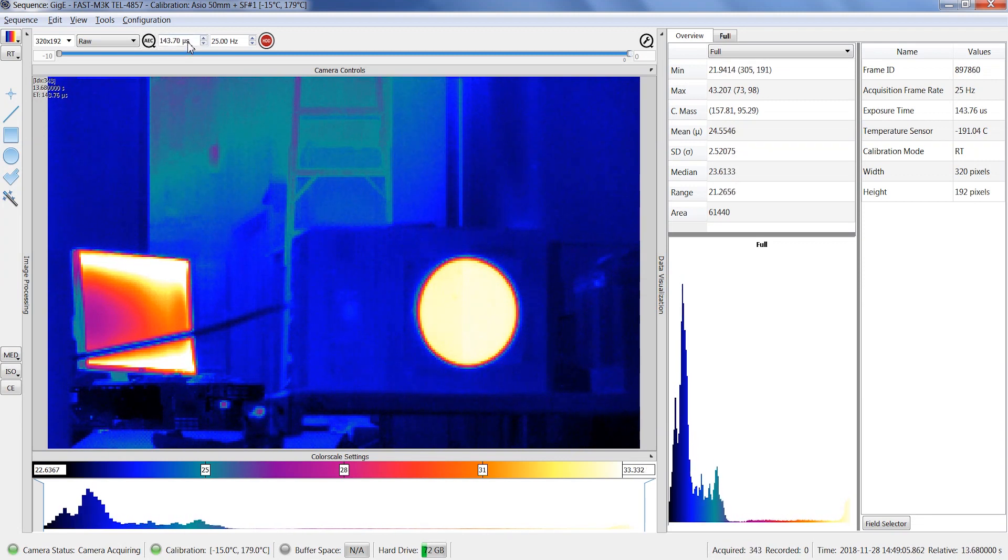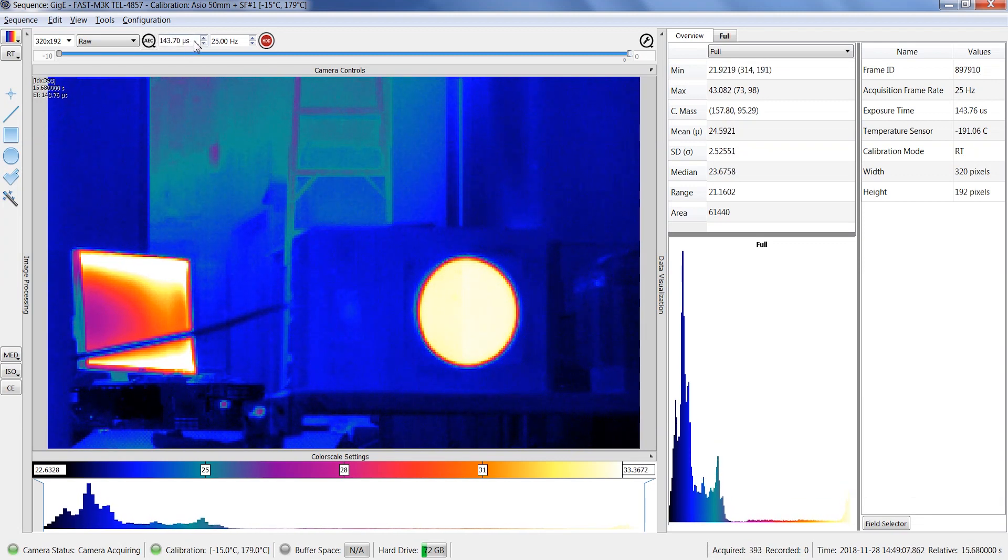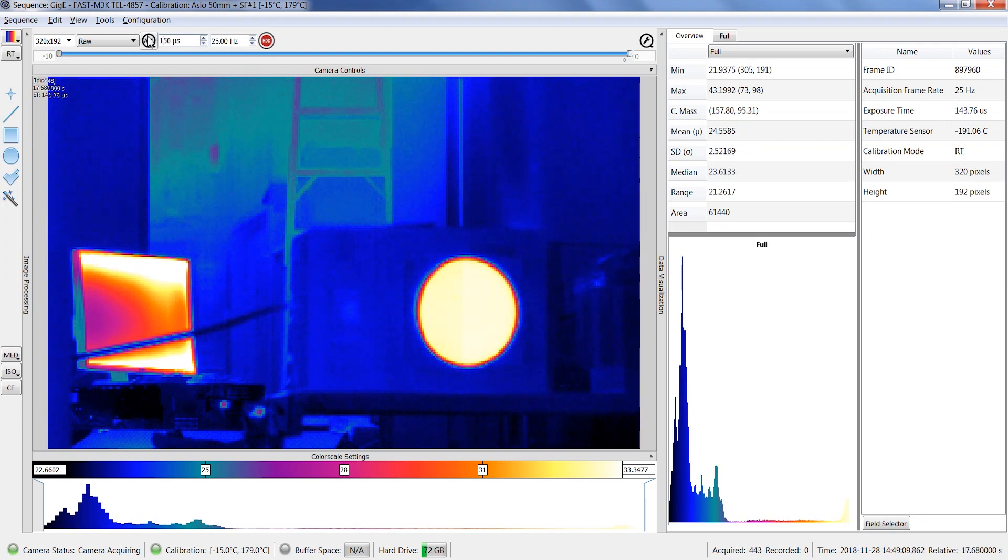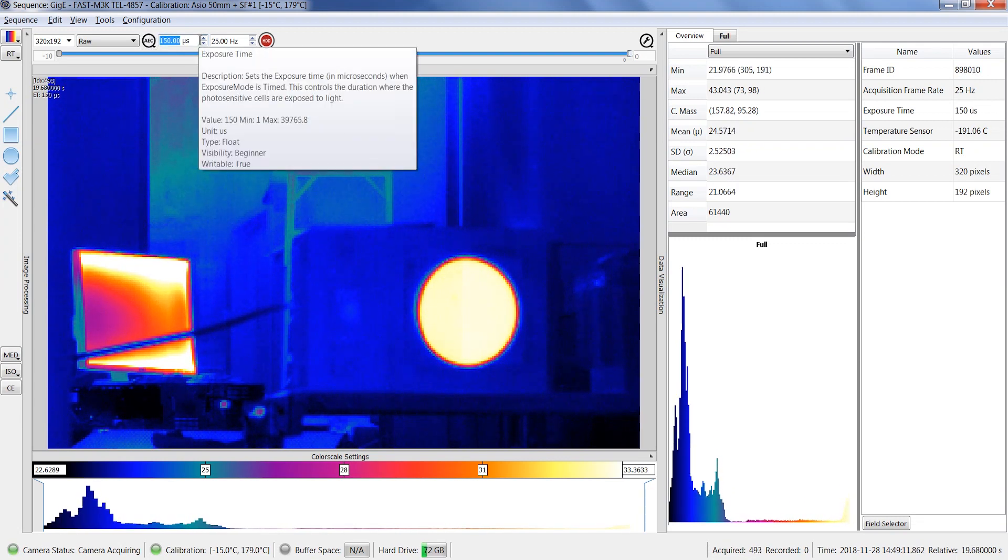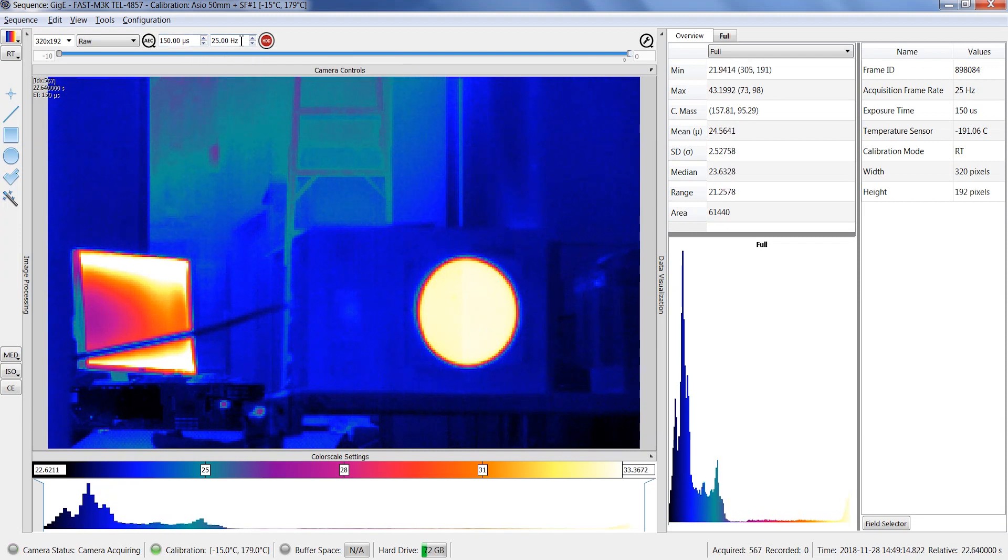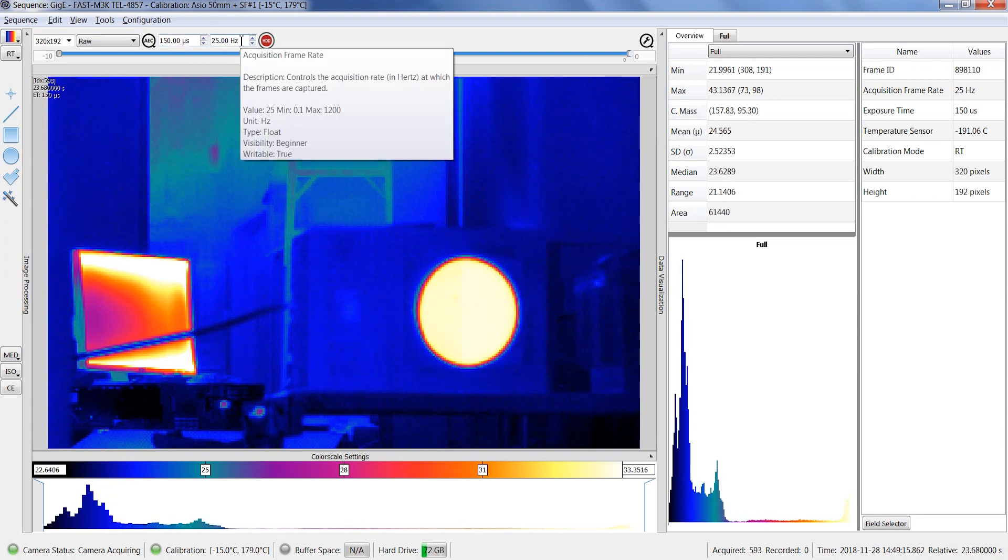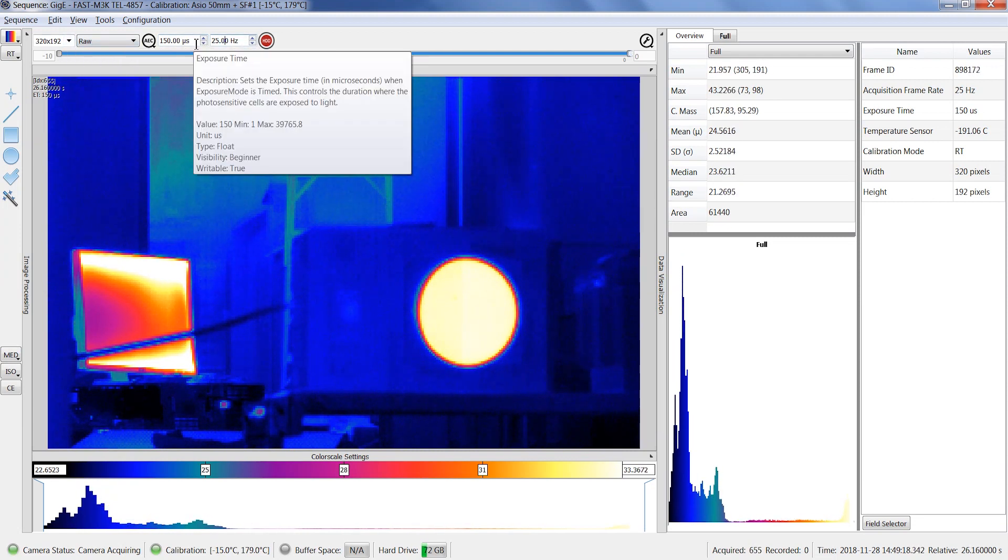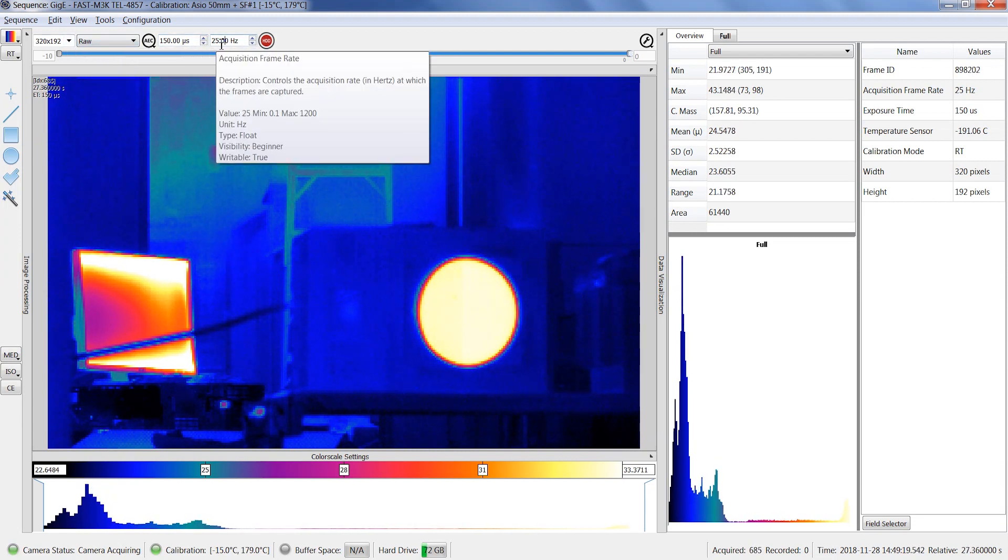The frame rate can easily be changed. You can also refer to the tooltip for this. Frame rate, window size, and exposure time are three parameters that influence each other, so decreasing one parameter may allow to increase another one.